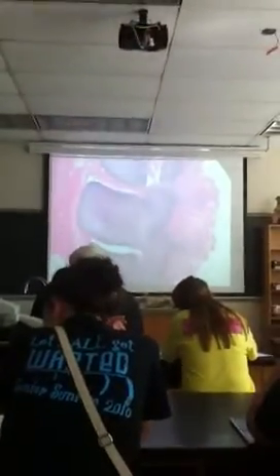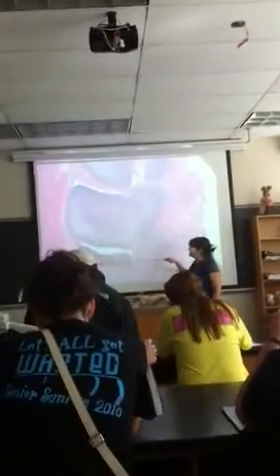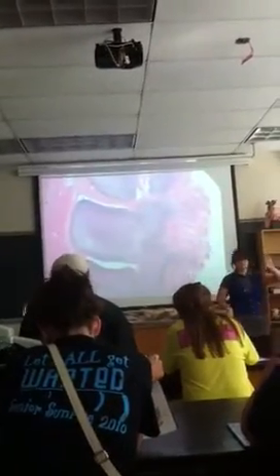Last one is the ileum. And once again, you have the same four layers. You're going to have mucosa. This whole thing right here is submucosa, which obviously you can see these big things here. I'm going to talk about those in a second. Muscularis externa, and I can pan out a little bit more to find the serosal layer.